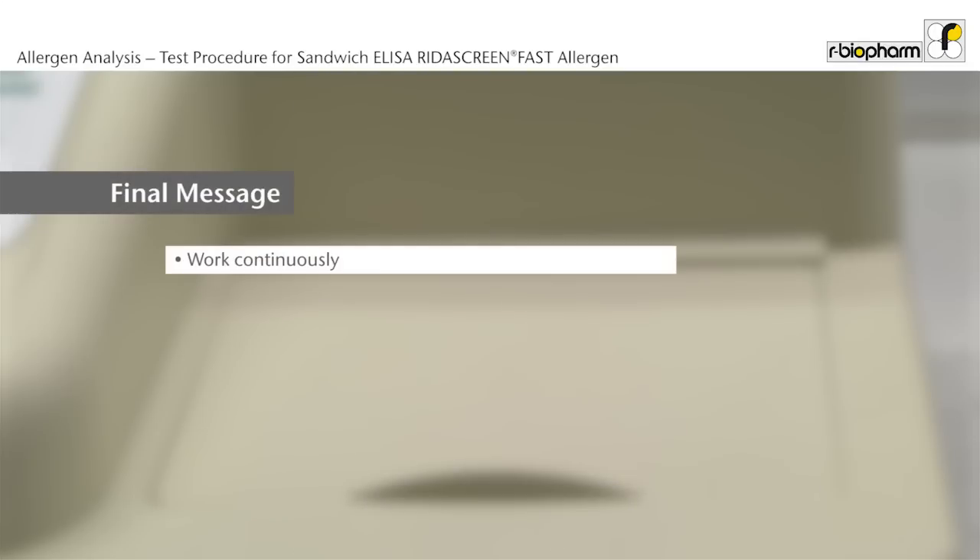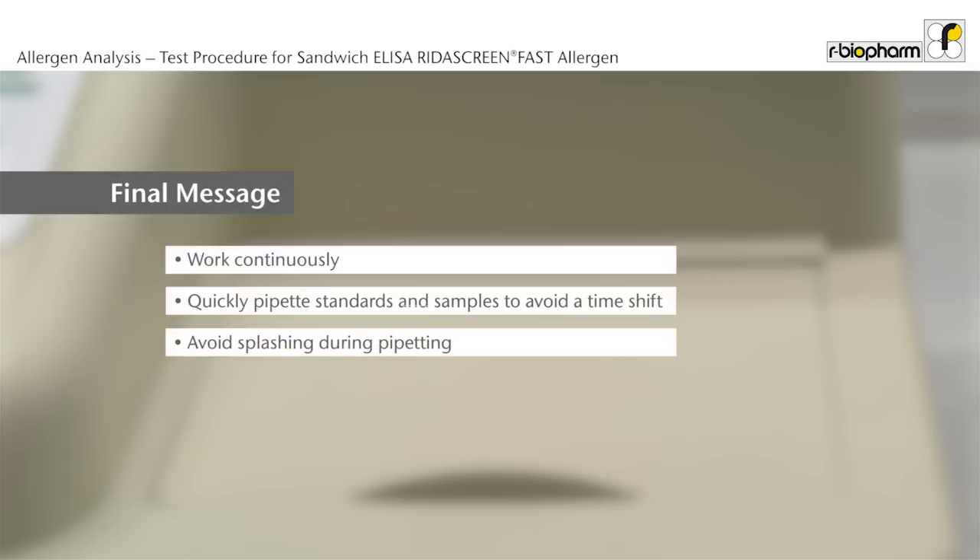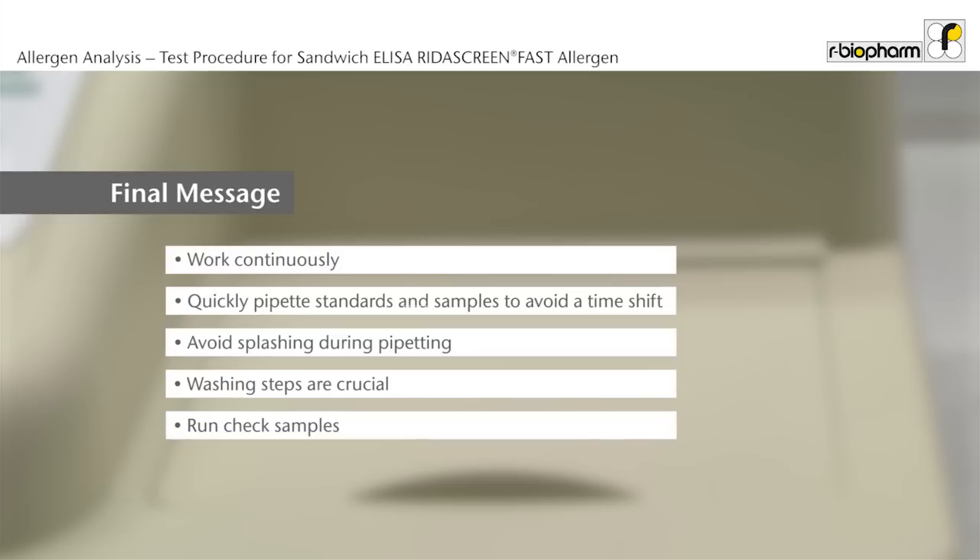Have a continuous workflow during the assay procedure. Please notice that the reaction starts with the addition of the first standard or sample to the plate. Therefore, standards and samples should be added quickly to the plate to avoid a time shift. Avoid splashing. Washing steps are crucial and have to be carried out thoroughly. Run check samples — for example, R7012 — with known concentrations for quality control.